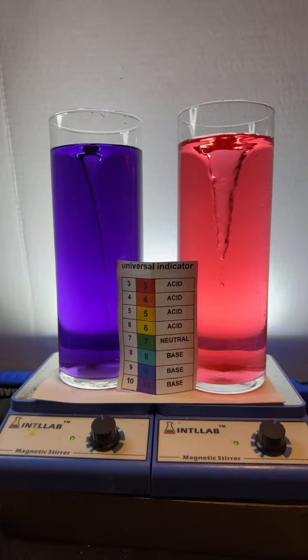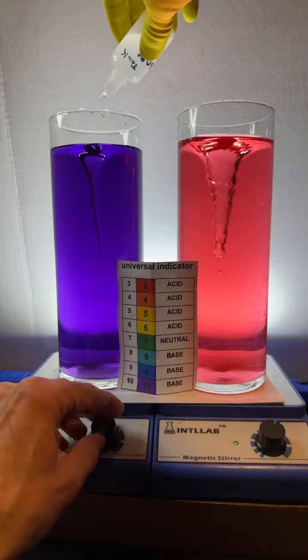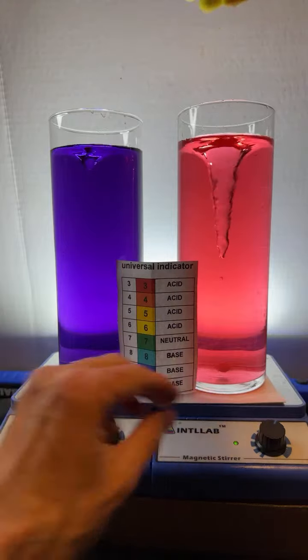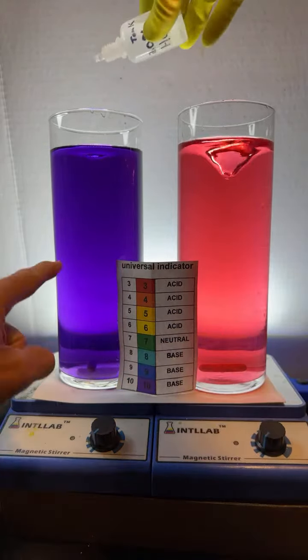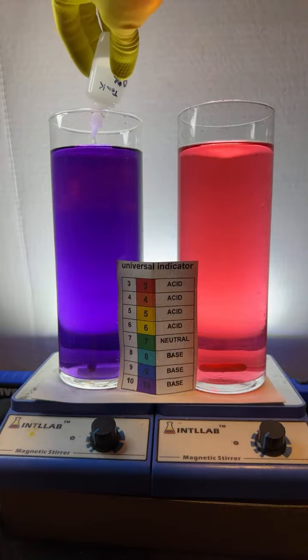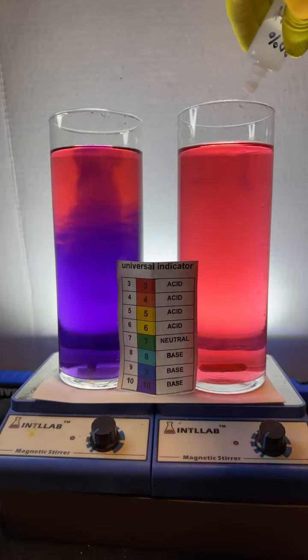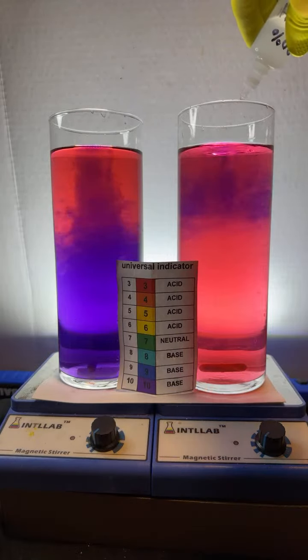Very nice. Is it possible to do primary colors then mix it up to get secondary colors? Israeli, that's not exactly how this works. This works on acid-base neutralization principles. I'm going to turn both these off. And to this flask on the left, I'm going to add some acid. And to the flask on the right, I'm going to add some base, and we're going to watch it slowly react. You know, it doesn't homogenize immediately.